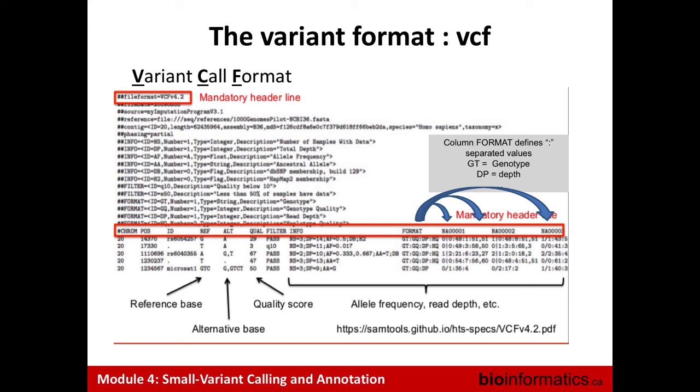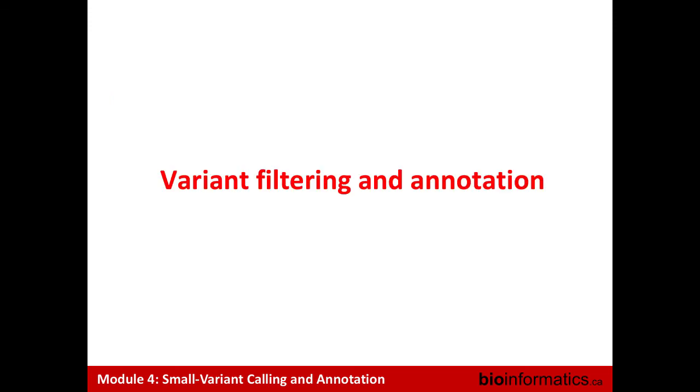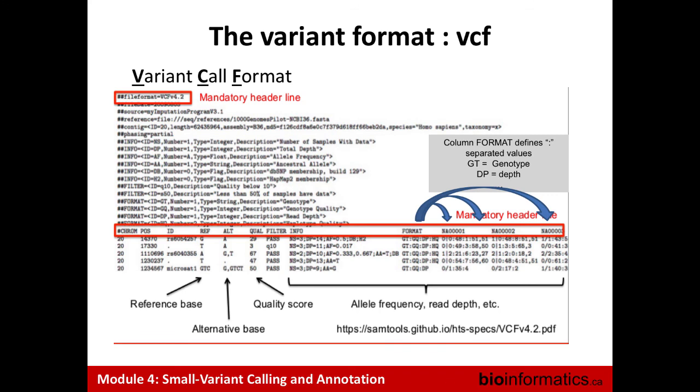I have to ask you another question about the multi-sample approach. Let's say you have a NovaSeq exome run with 96 exomes. A couple of the samples come in with really low coverage. Probably you will end up with lower quality samples, so the quality of the sample will be lower due to the lower quality of your data. But as you use the same exome kit, the same sequencing approach, it has less information. So taking information from the others would be the best way to maximize what you can get from this data. If you separate them with so little information, you will have a really low level.